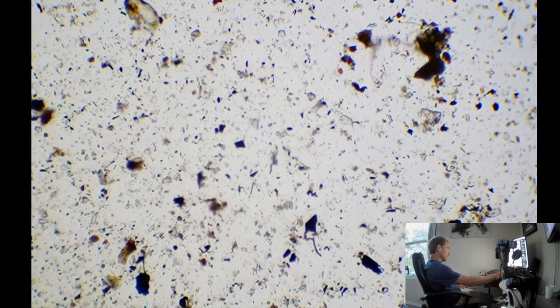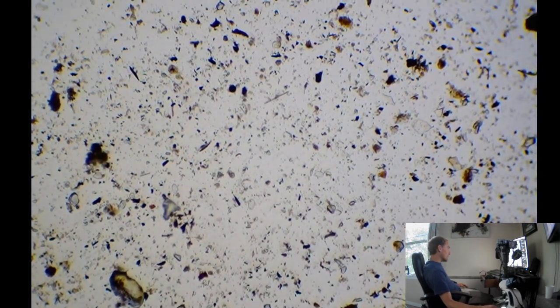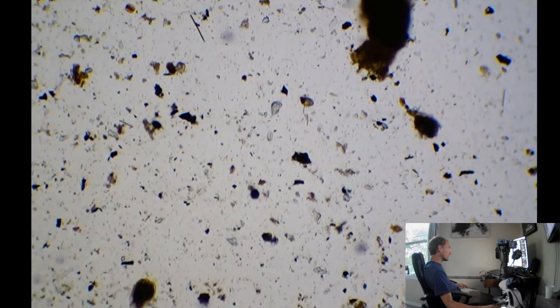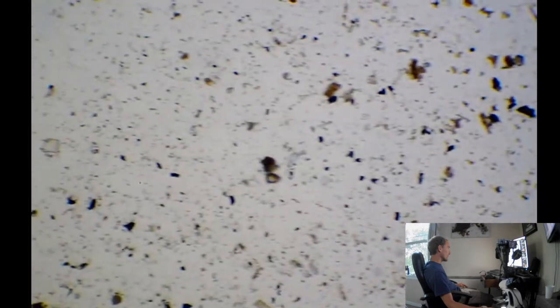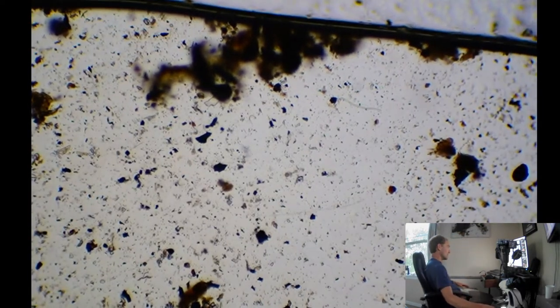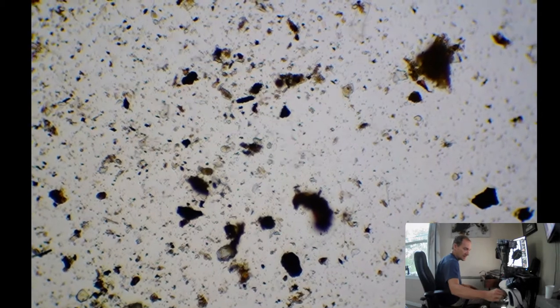Less light. Let's see if we can find something big moving around in there. It's cool to look at. And there's the edge. Oh no, we're drying out. We still got time. Let's go over here. Anything up here? I think that motion was just it drying, pushing stuff around. Let's go down and finish this scan. Oh, what's that? That's a nematode. Let's go in and check him out.